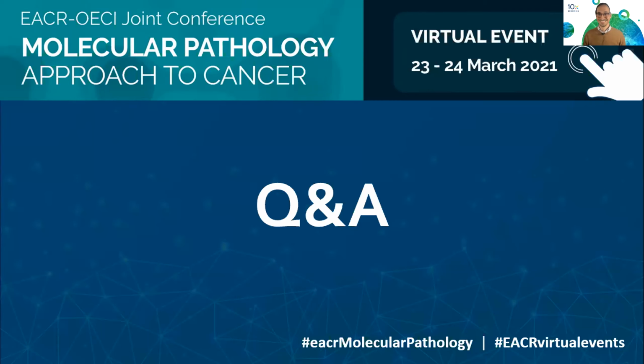There are 2 things linked here: what are the challenges for a new user to start with this technology, and what are the costs? Great. So the challenges, I think the strength of this is also the challenge, which means you have a pathologist or a histologist in general, someone who's used to working with tissues, and then you have someone who's used to working with next generation sequencing. So one of the things that has to happen is a collaboration between those.